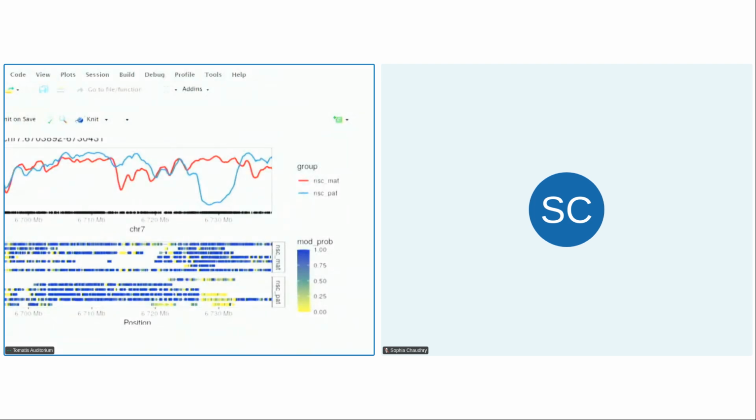And underneath the aggregate trends, you'll also see a heat map corresponding to the individual long reads. So this is also the sort of information you don't tend to see if you were doing short read experiments, because short reads don't tend to overlap too many CpG sites. So people just have site level data, whereas with long reads, you can actually do studies of trends along individual reads. I don't do that because I'm not smart enough, but it's something you could do, and the information is there.